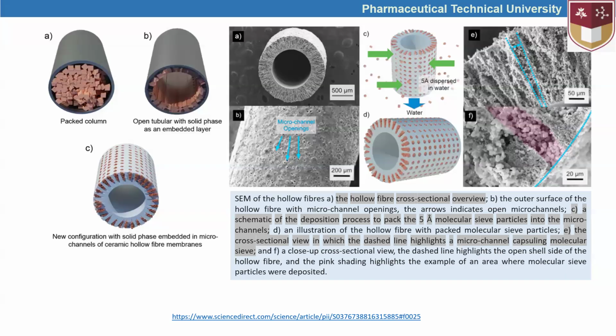I'm not going to repeat those things again. Based on the functional groups of the materials that are used in the matrix, we can expect faster or slower movement of the compounds to be separated inside the columns. Okay, good.